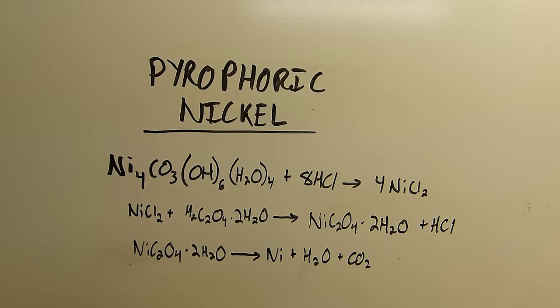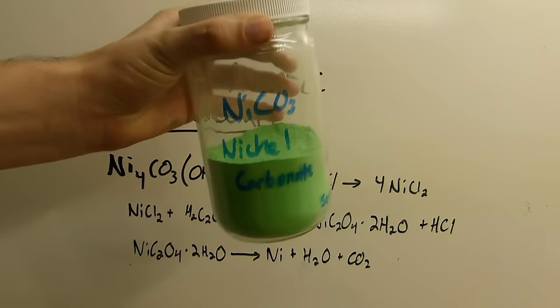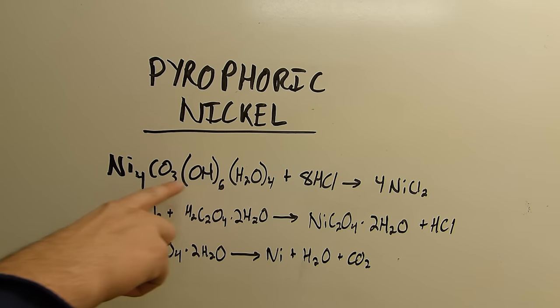So I'm going to do that today using pretty much the same process. I'm going to start by making a soluble nickel salt and I currently only have this nickel carbonate. It's powdery grade basic nickel carbonate. You can see the formula for it here.